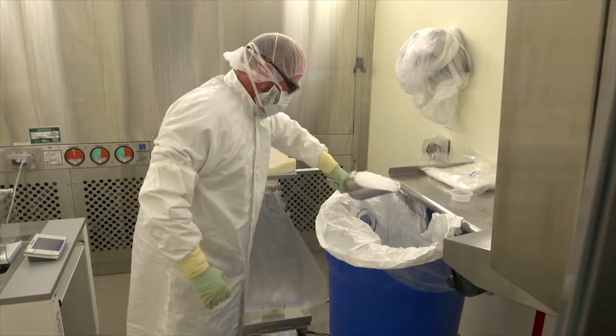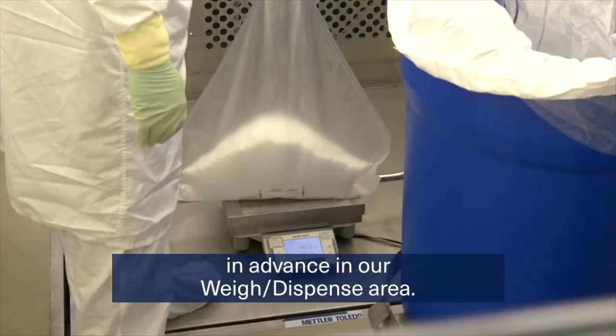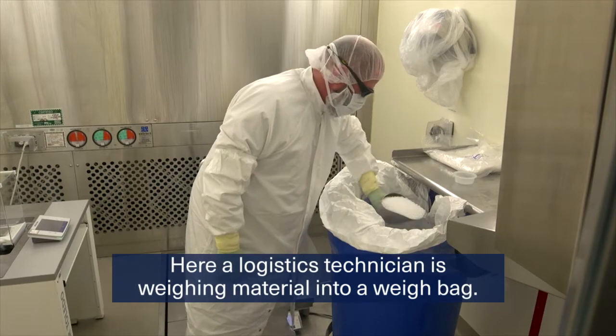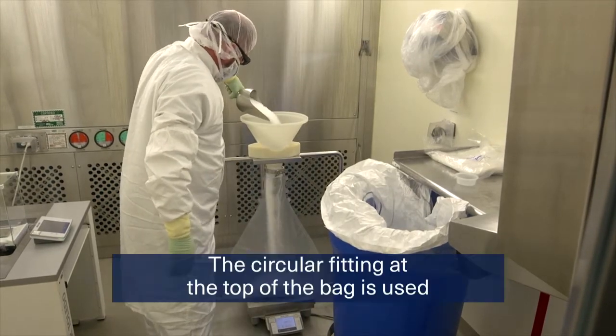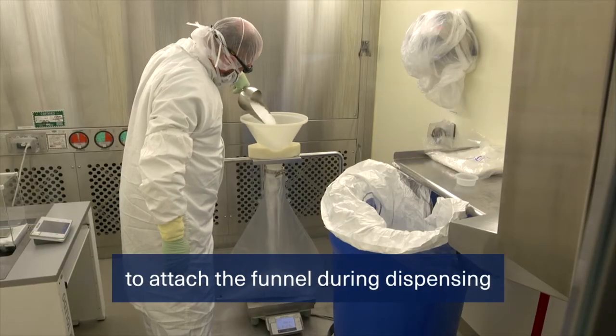We make lots of solutions. Most of the materials for those solutions are weighed in advance in our weigh dispense area. Here, a logistics technician is weighing material into a weigh bag. The circular fitting at the top of the bag is used to attach the funnel during dispensing.